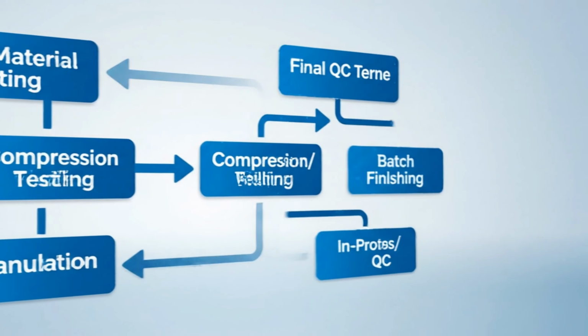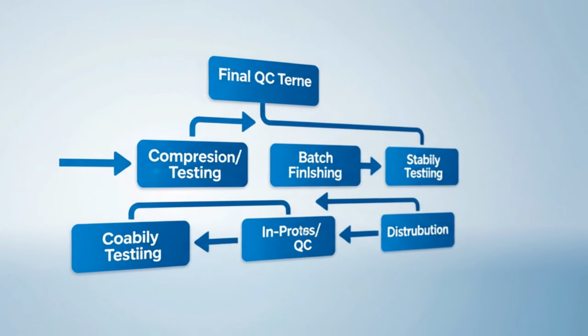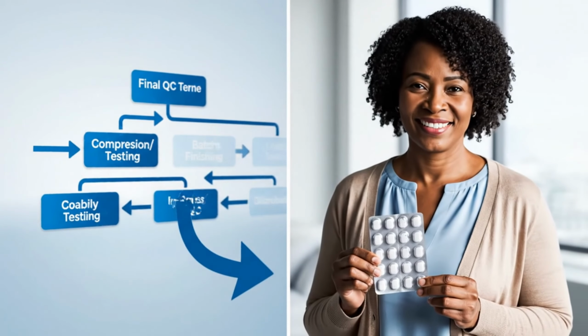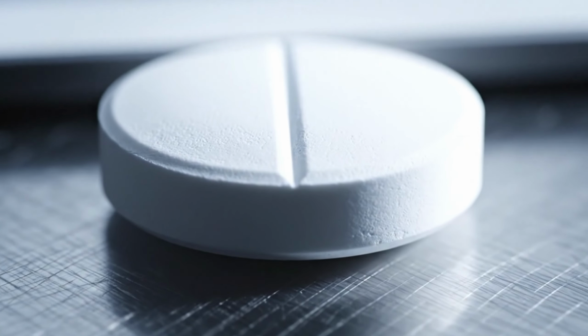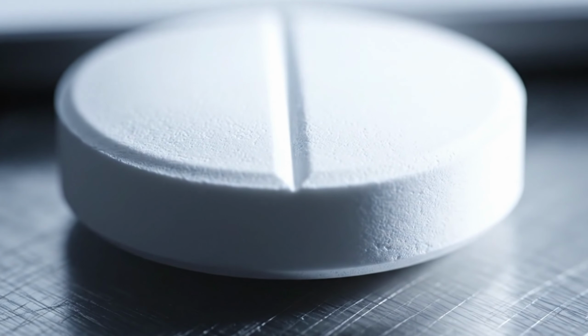Every step you have seen in this video is required. None of it is optional. Every test, every record is essential. The next time you take a tablet or capsule, you will know exactly what it took to put it in your hand.